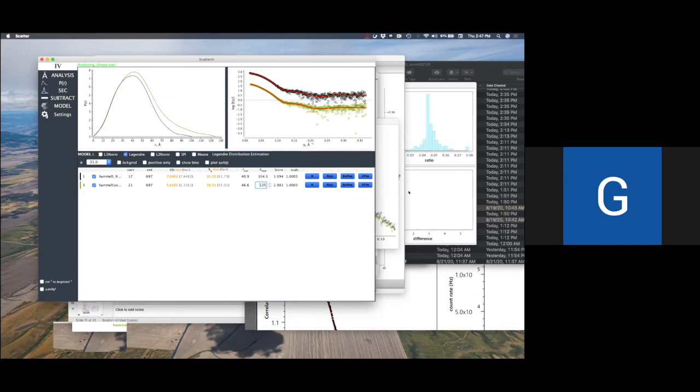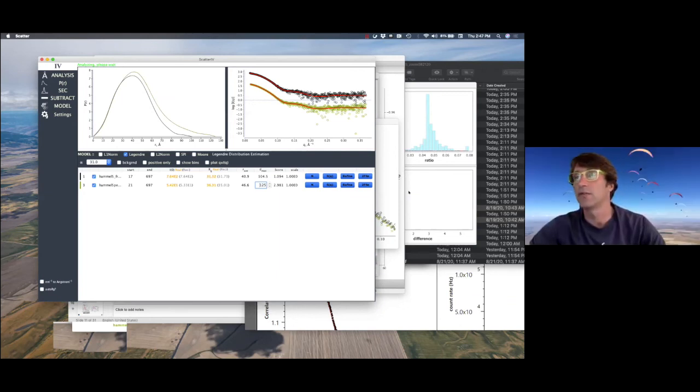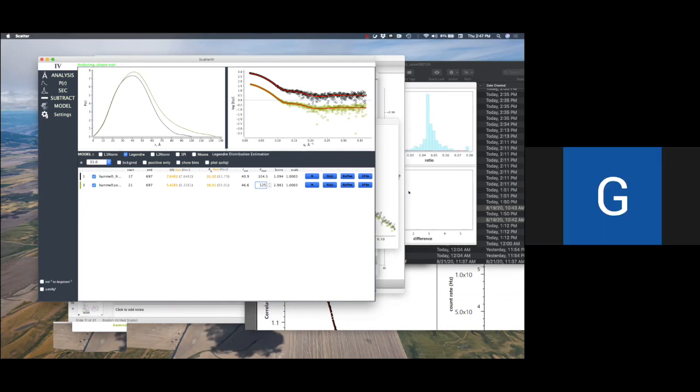Yeah, other people, I would just like to add to this whole process for everyone who's out there, to state that from the beginning, evolving factor analysis, in the sense of singular value decomposition, assumes that there's a scattering curve that's going to be most prevalent in the beginning and is going to diminish with elution time, and it's going to transition to something else. That is the benefit of this evolving factor.